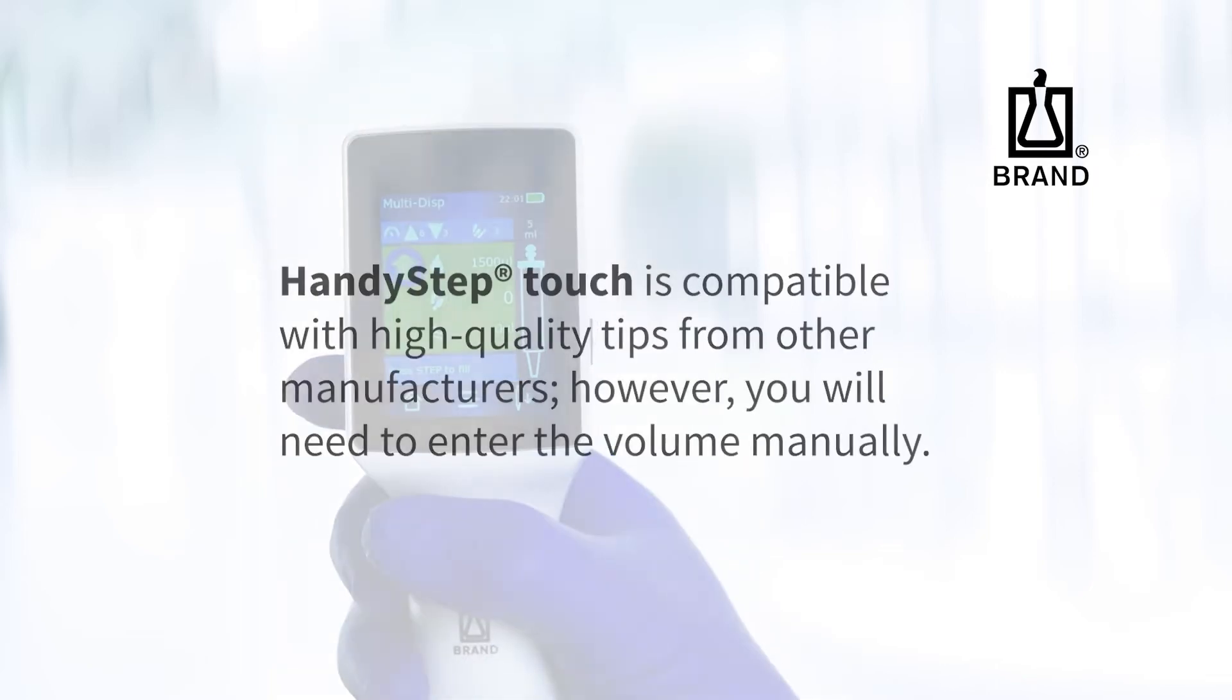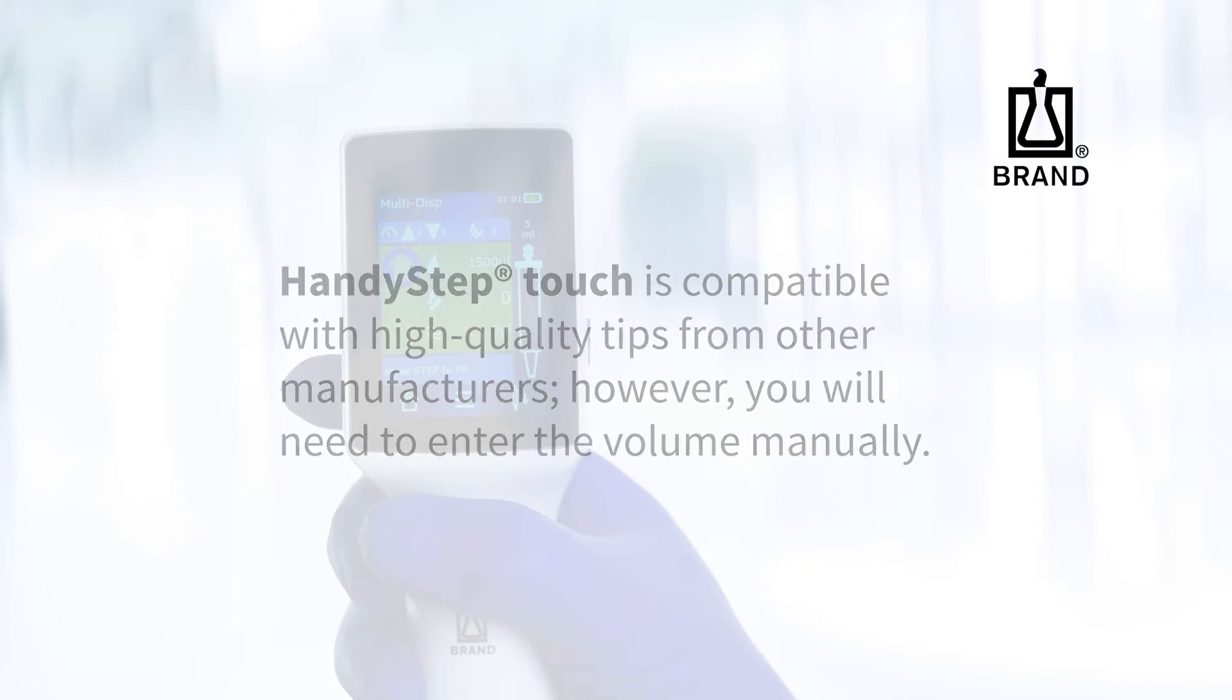The HandyStep Touch is compatible with high quality tips from other manufacturers, however you will need to enter the volume manually.